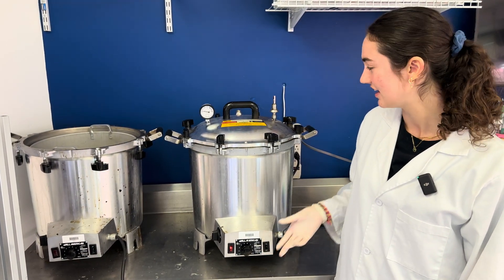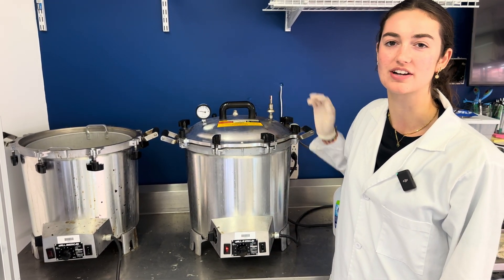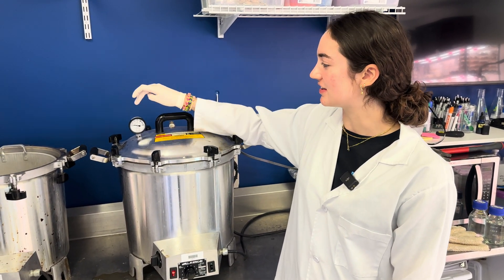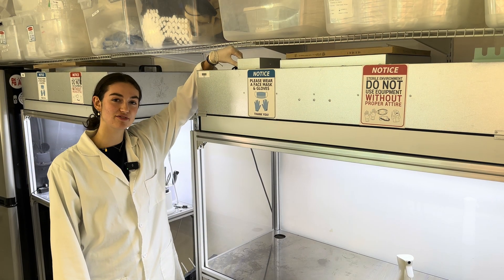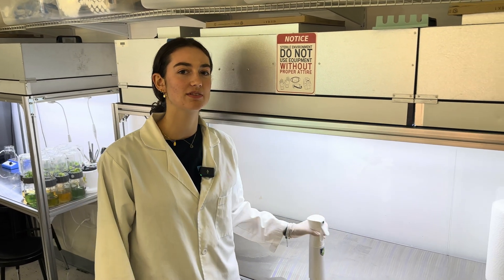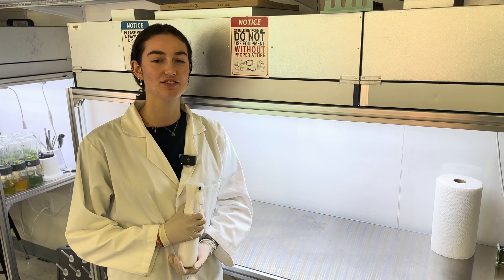Now turn on your pressure cooker and make sure that the valve is open to allow air to escape. Now that the steam is coming out, you can close your valve, and then once your pressure cooker reaches 15 psi, set a timer for 20 minutes. Turn on your laminar flow hood 30 to 60 minutes prior to doing any sterile work, and then wipe down all surfaces using 70% isopropyl alcohol.